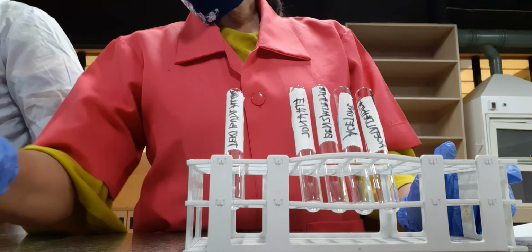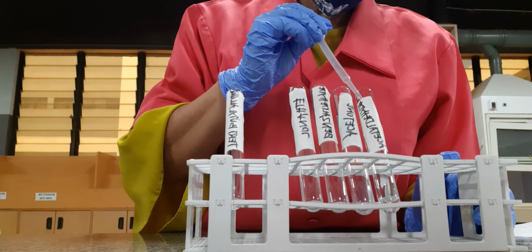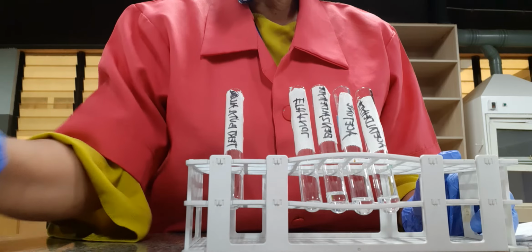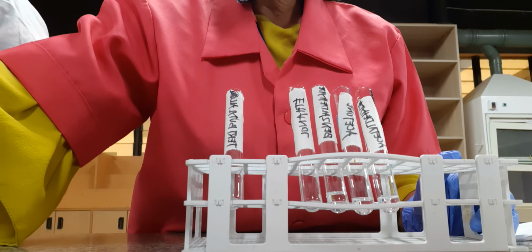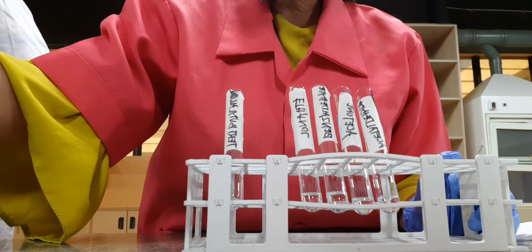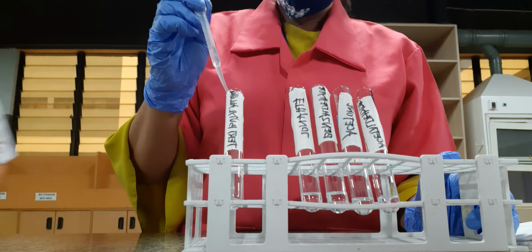So 1 ml ethanol, acetaldehyde, and then 1 ml of acetone, then 1 ml of benzaldehyde, and then 1 ml of tert butyl alcohol.